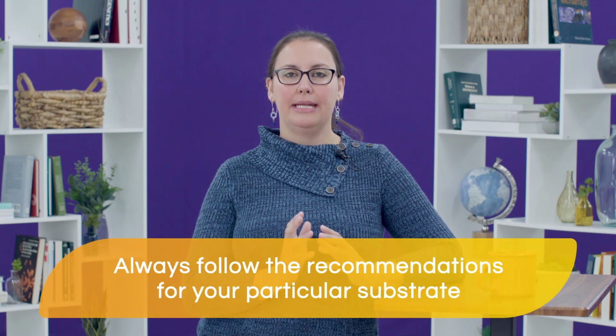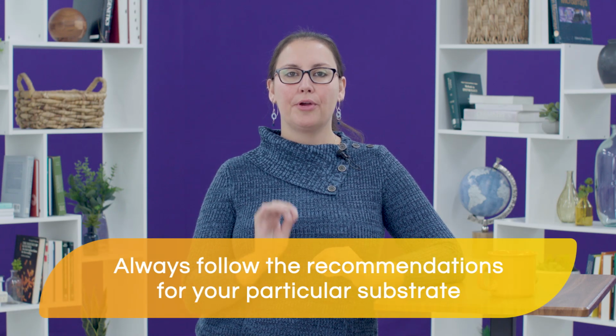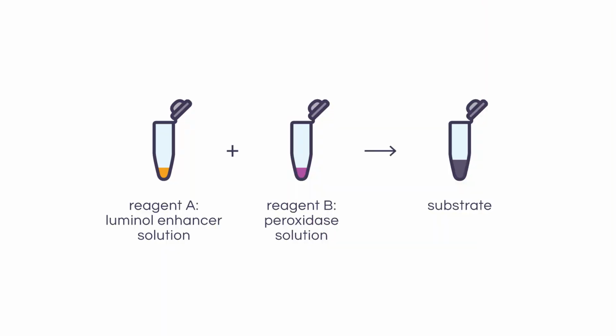Always follow the recommendations that are specific for your particular substrate. In most cases, the datasheet is going to recommend that you mix reagents A and B in a 1-to-1 ratio. Reagent A typically being the luminol enhancer solution and reagent B typically being the peroxidase solution. However, that can change from kit to kit. So again, double check the datasheet of your substrate and make sure you follow all of their recommendations.